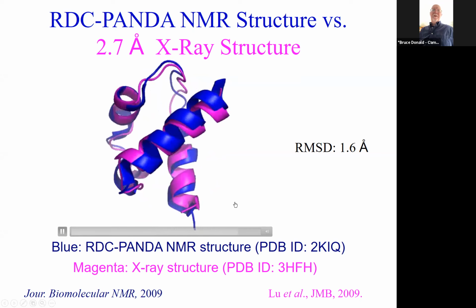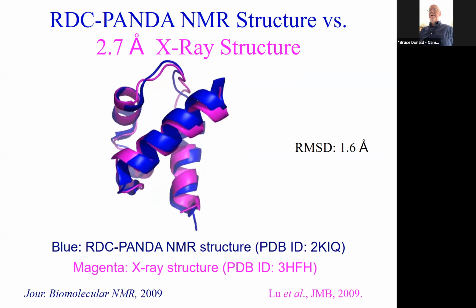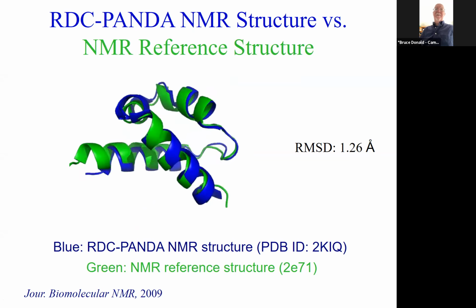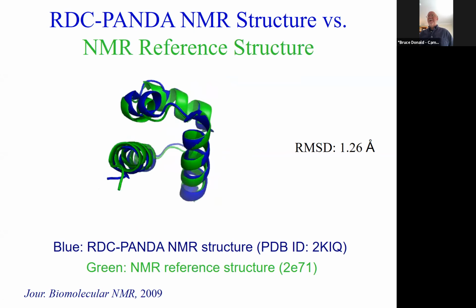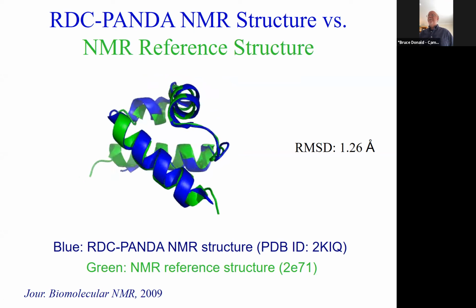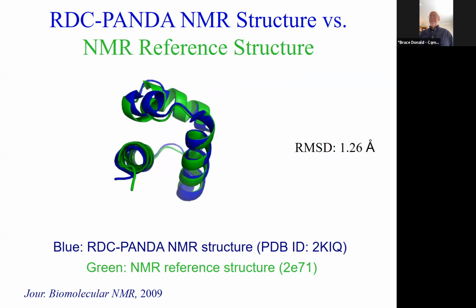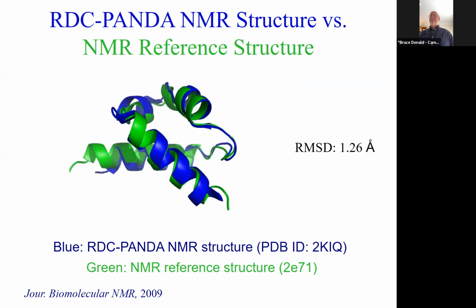So there's reason, proof of concept that such a thing can actually work meaningfully and also be mathematically elegant. There was also at some point an NMR reference structure solved, fairly similar to traditional NMR methods, but using a bit less data. So good correspondence with orthogonal methods, either in terms of biophysical techniques or in terms of algorithm.